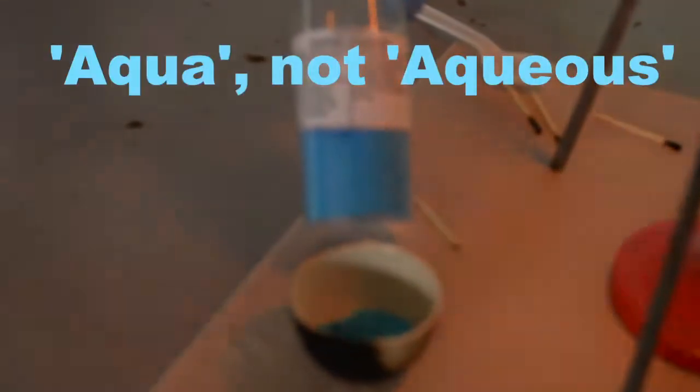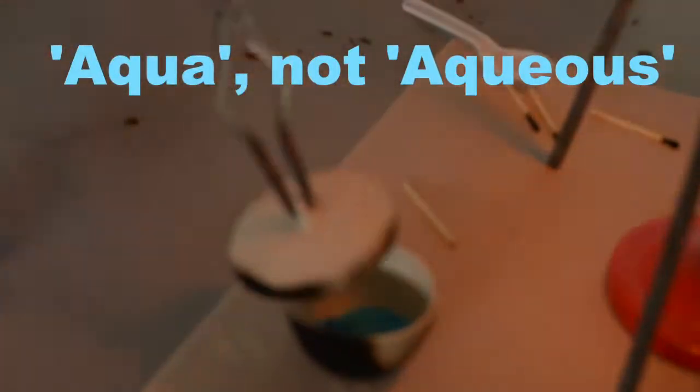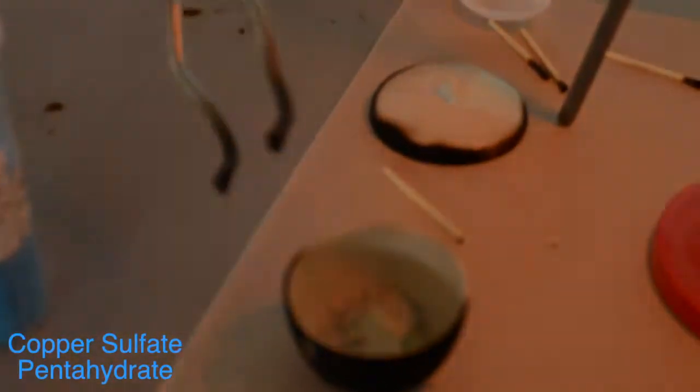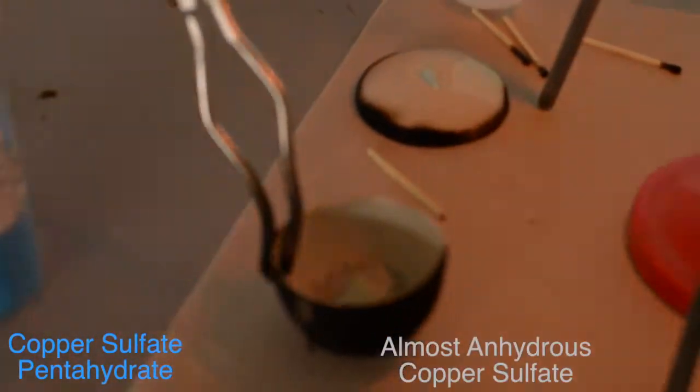We're just getting a brighter color. We're almost to the end here — we've just been heating on the Bunsen burner for about five or so minutes, and the color change between the pentahydrate and gradually getting closer towards the anhydrous state is becoming visible.